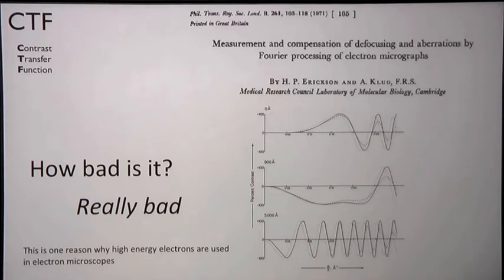So what I'd like to do is at least give you a sense of where these curves come from, these wiggly curves that Tony showed and that you're going to spend a whole bunch of lectures figuring out how to compensate for later. But I want to give you a sense of where they actually come from. And they come from the lenses, the optics, right? A perfect optical system would not cause this.